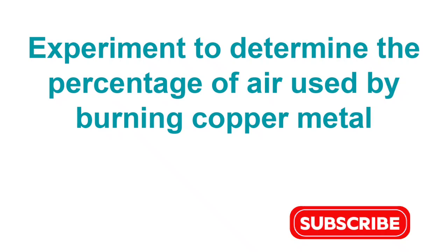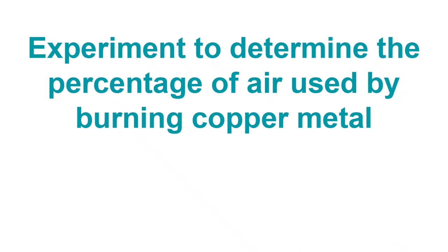Welcome to our today's class. It's on an experiment to determine the percentage of air used by burning copper metal.